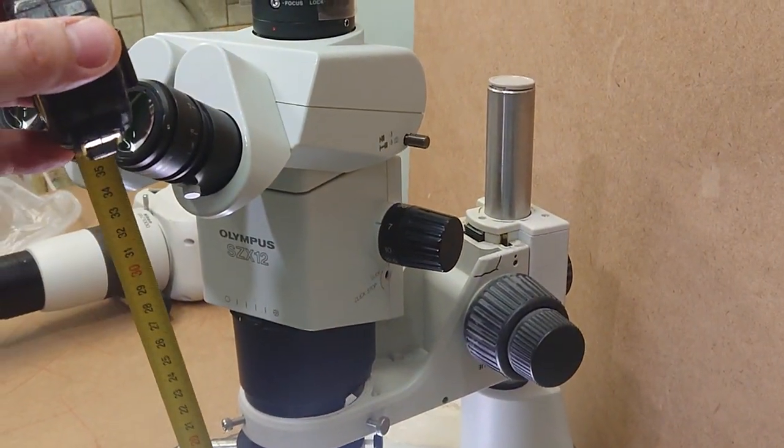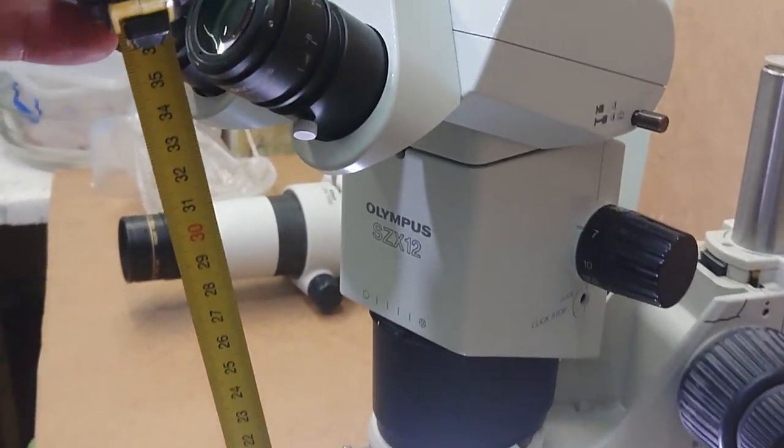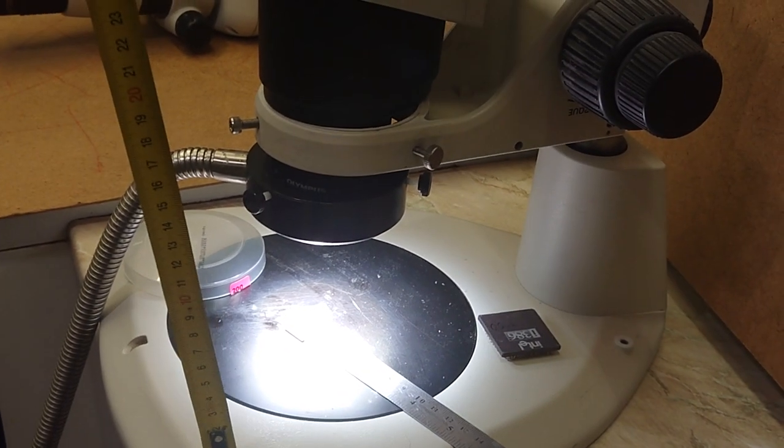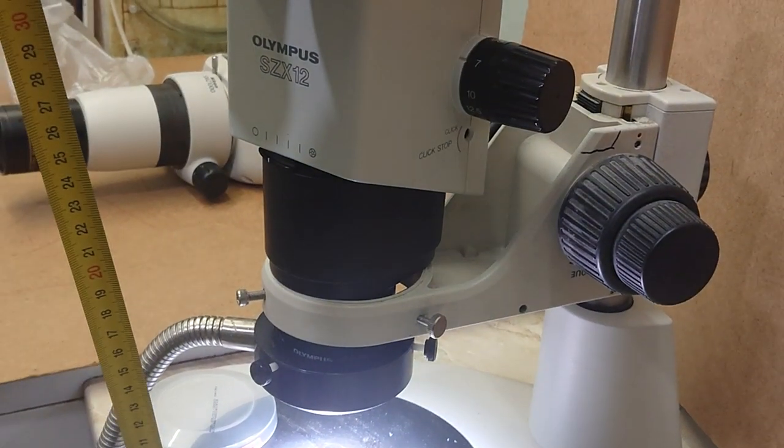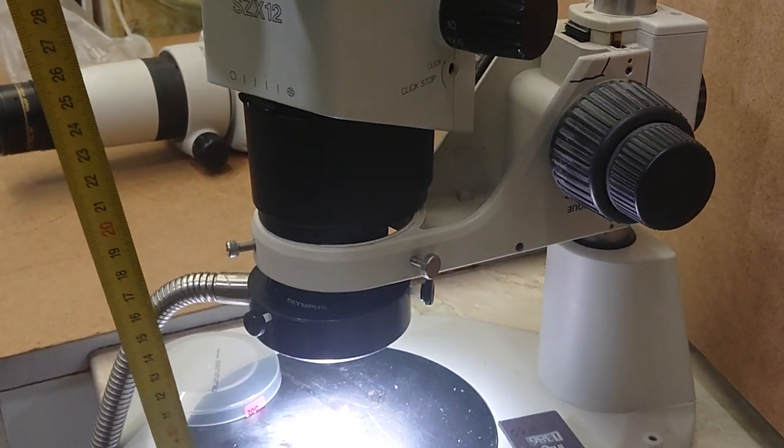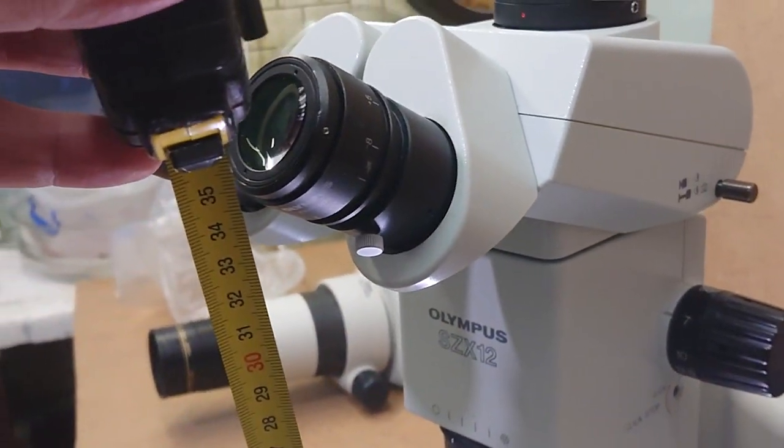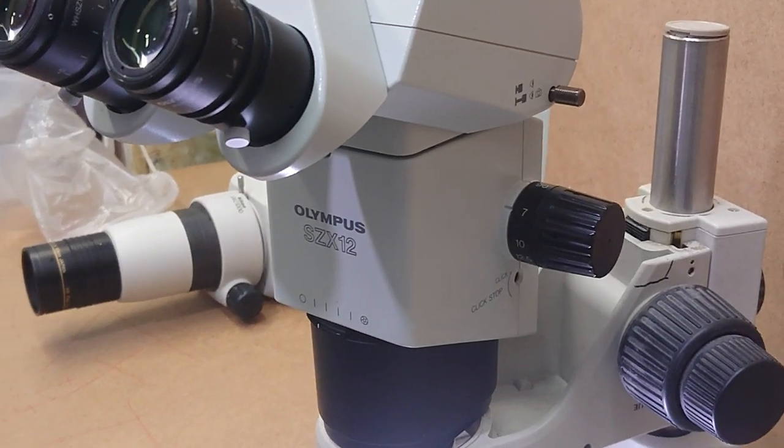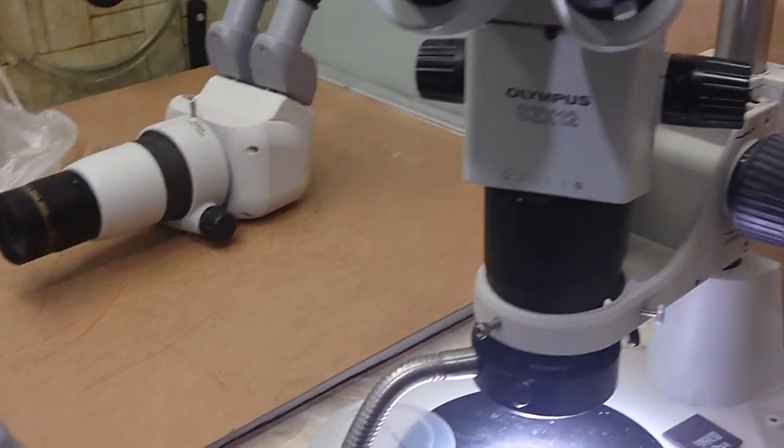Let's firstly see the working distance between the plane of objects and eyepieces. In our case we have 35 centimeters. I'm not connecting the ruler to the center of the object, I'm connecting it kind of 10 centimeters ahead of the center plane, so technically we have 35 centimeters. Not that big a distance, just a bit higher than from our Olympus SZ61.